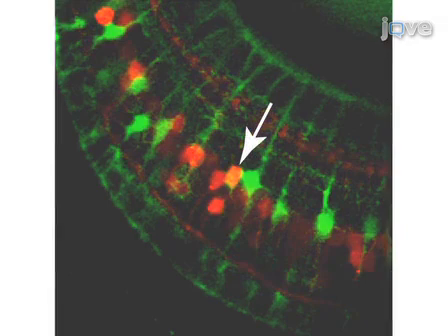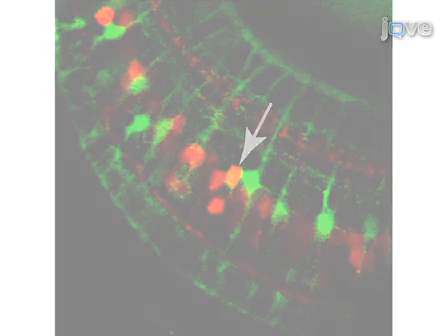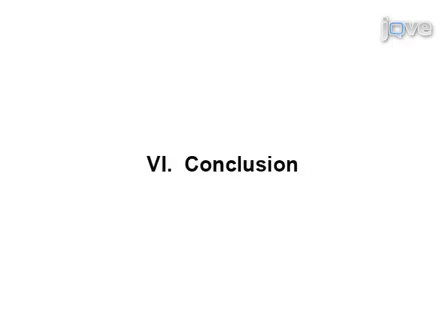The data shown here suggest that bipolar cell ablation triggers Muller glia to replace the lost cells. This interpretation is in keeping with recent studies of retinal regeneration, which implicate Muller glia as injury-induced progenitors in both mammals and fish. This technique allows researchers to explore mechanisms regulating the regeneration of specific cell types through visualization of stem cells in zebrafish.